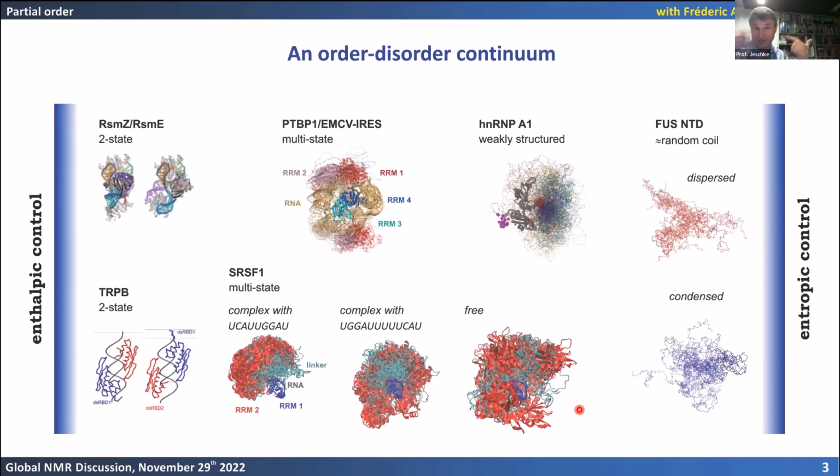And if you think about designing a system like this, you have to design it as a flexible system. Only then will it work, because the different RNAs have different shapes. This means if you bind different RNAs, in our case to the SRSF1, the slightly longer one and the slightly shorter one, then you will end up with different ensembles. And it is clear that to understand how these proteins process RNA, you need to be able to get some structural models. And for this, we need the technique.